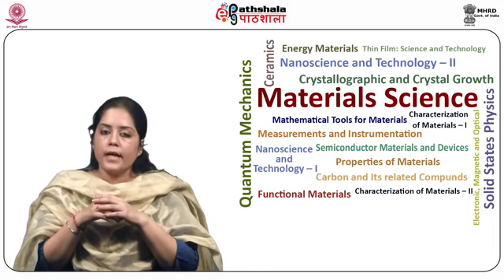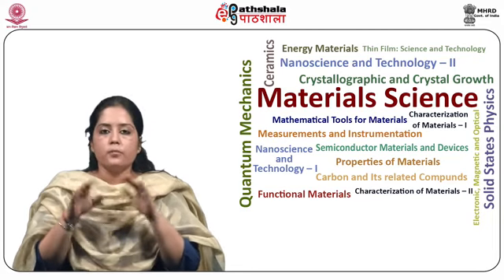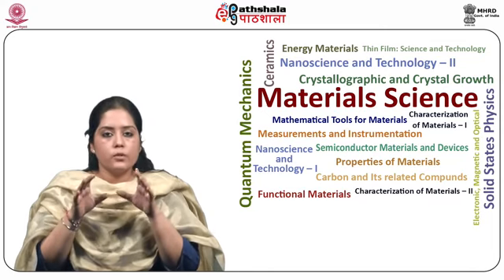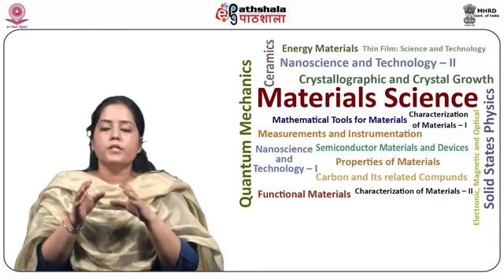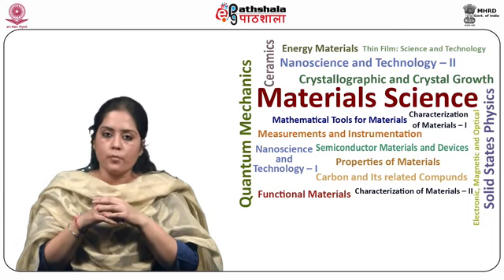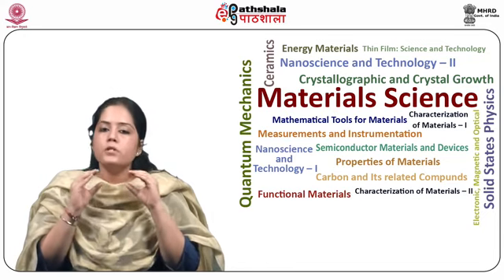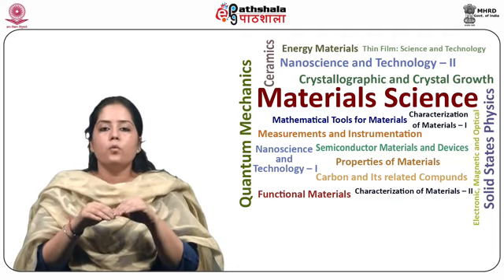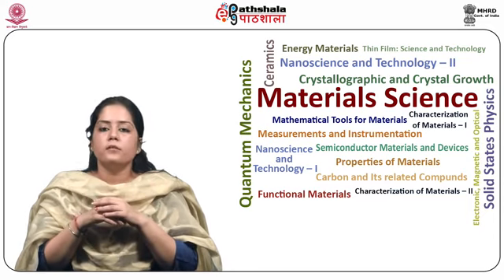Thus, in order to get a stable emission, a highly stable voltage must be applied to the lamp. The stability of the voltage is ensured by using electronic voltage regulators or constant voltage transformers. Tungsten halogen lamps include small quantities of iodine embedded within a quartz envelope, which also contains the tungsten filament.